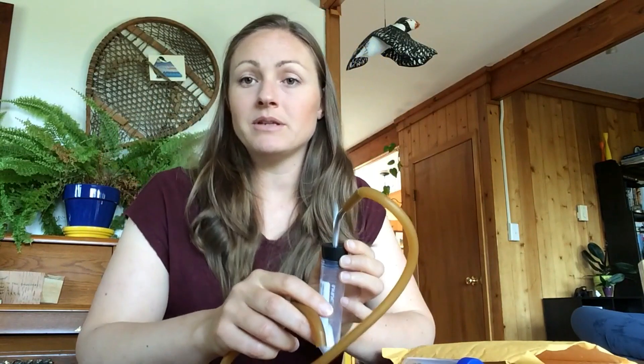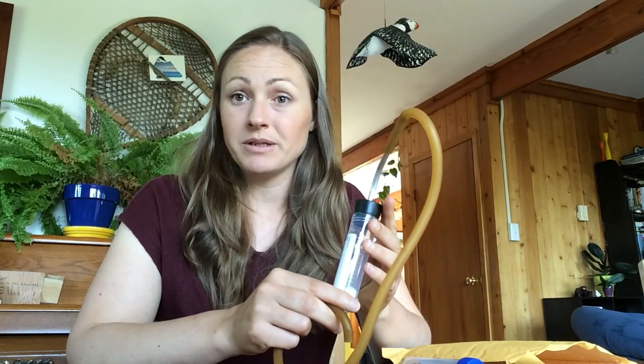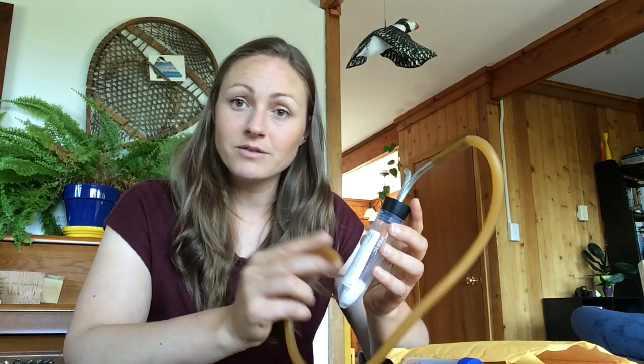You can collect as many mosquitoes as you want. What we're trying to do is have one collection tube correspond to one habitat. So if you then change habitat — for example, if you go to a lake or if you go to a bog — you're going to want to have another tube with you and switch tubes for the different habitat or location.